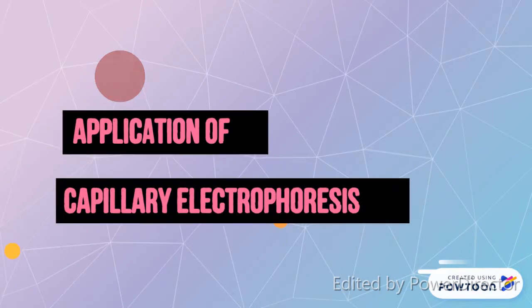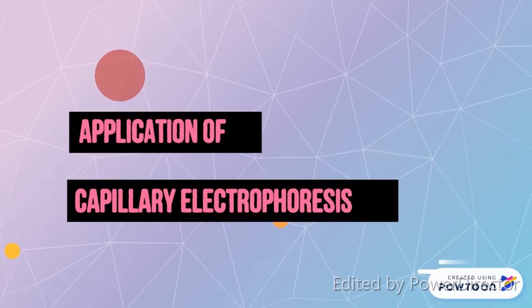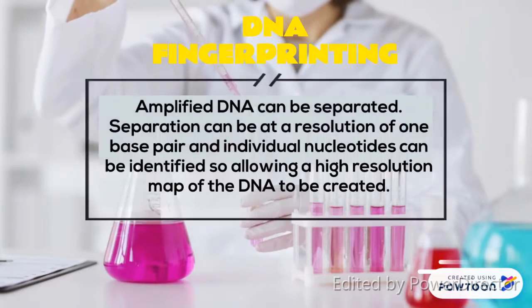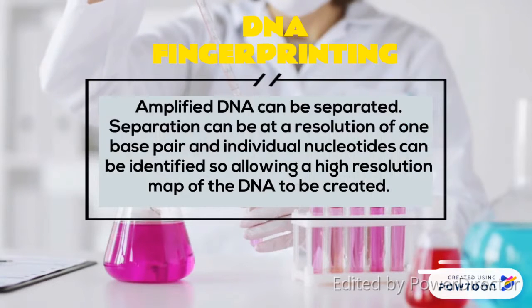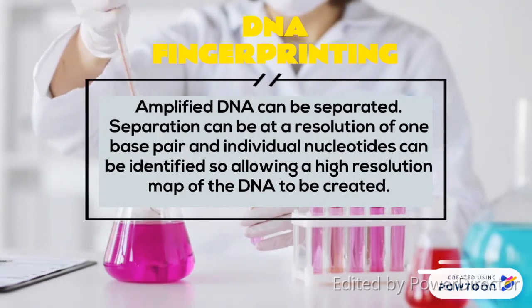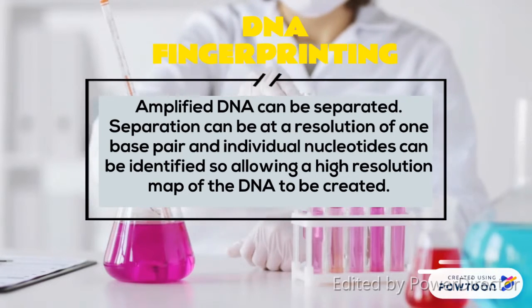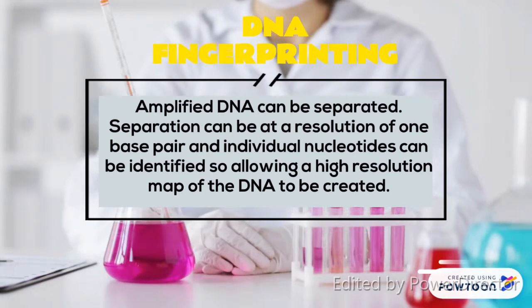Application of capillary electrophoresis. First, DNA fingerprinting. Amplified DNA can be separated. Separation can be at a resolution of one base pair, and individual nucleotides can be identified, so allowing a high-resolution map of the DNA to be created.